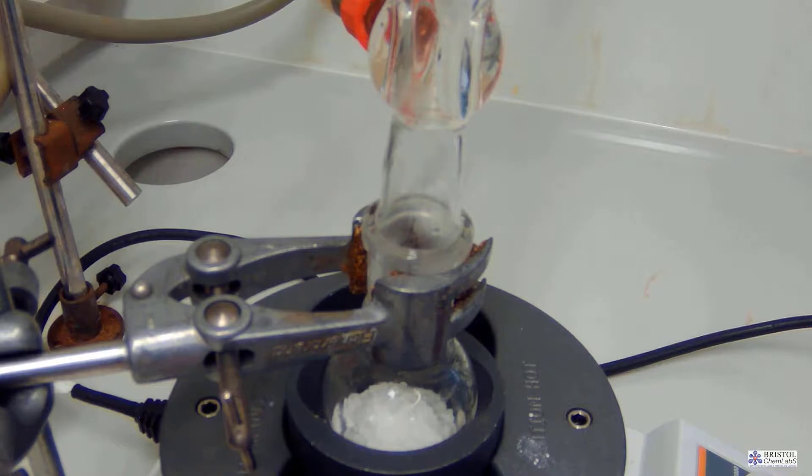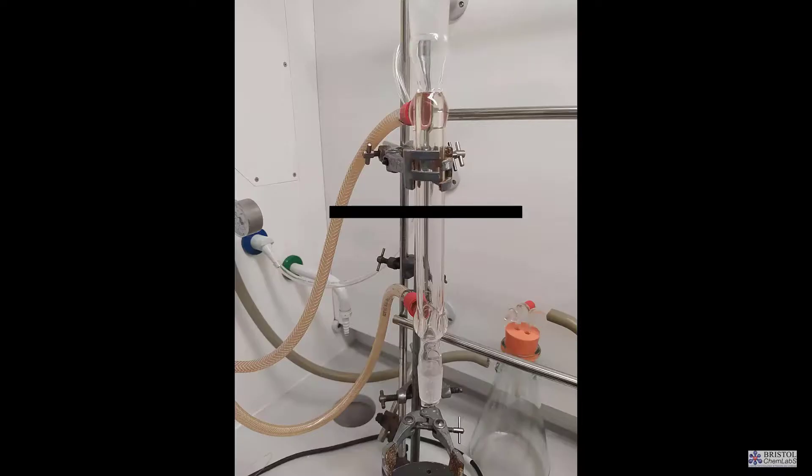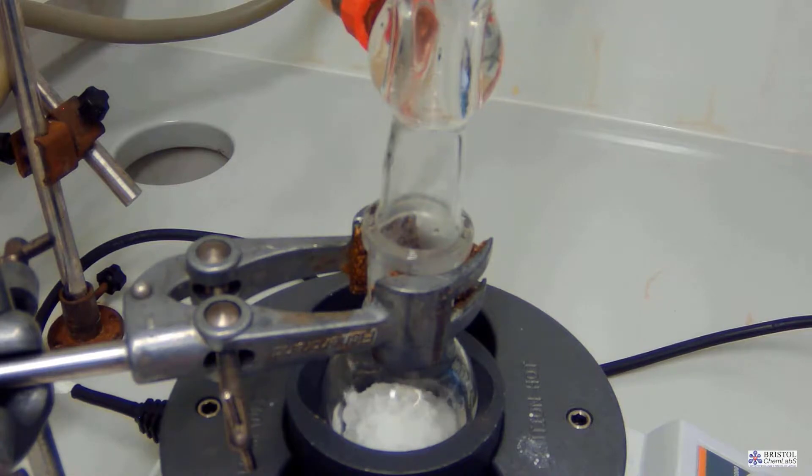The position where the condensation takes place in the condenser should not be any higher than two-thirds the way up the column otherwise you're likely to lose vapor out of the column. You can get condensers which are longer than the ones that we have employed here if high temperature reflux is required.